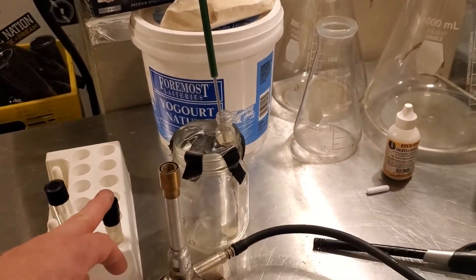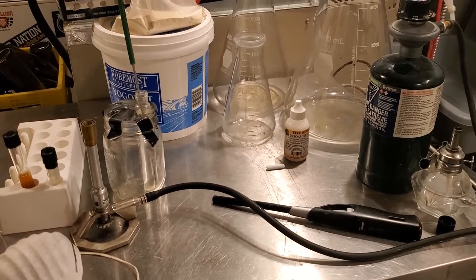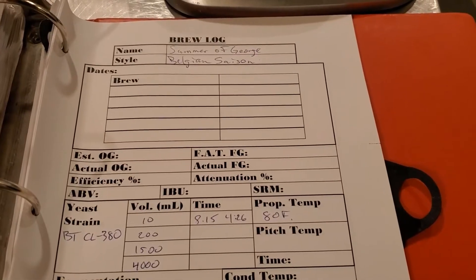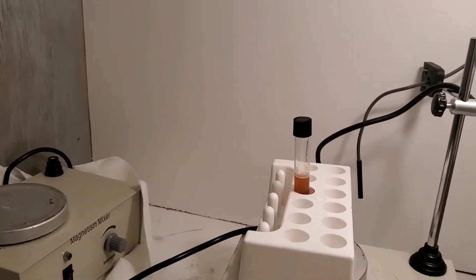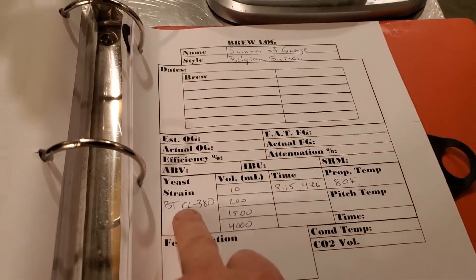I'm going to go ahead and inoculate the starter vial now. If you want to check out my detailed video on that first step, please do. A few minutes later — I did inoculate the starter vial, and you can see it here in the incubator warming up to 80 degrees Fahrenheit. I want to point out that I like to run a brew log on everything I do, especially with these yeast starters, so you can see I track the actual strain of yeast and go through my volumetric steps as well as timing.